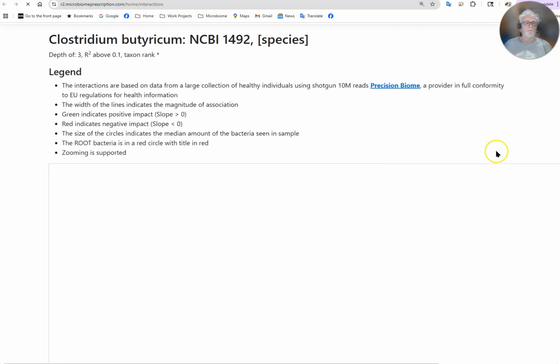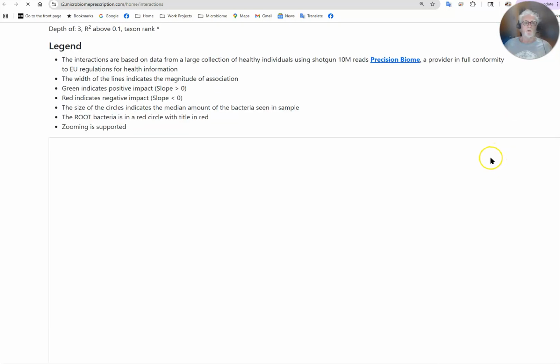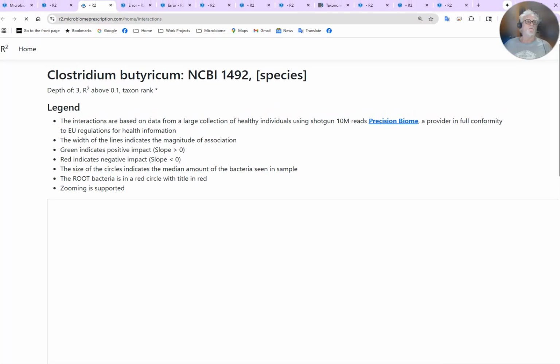Actually we come up with nothing there. It's still processing, and once the spinning ends, then we're rendered.